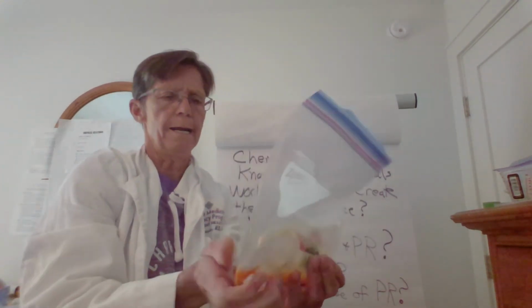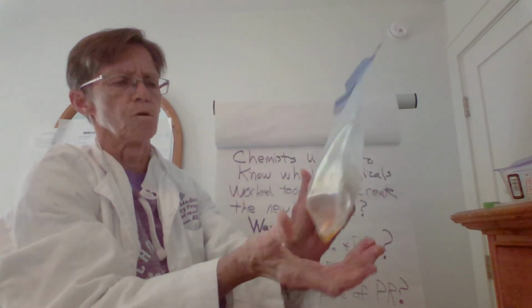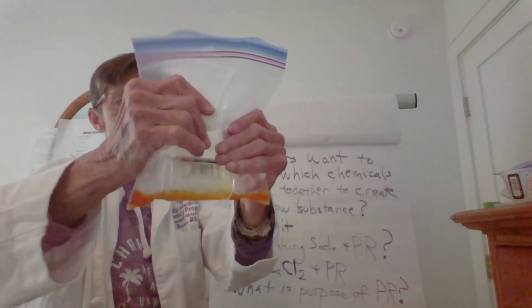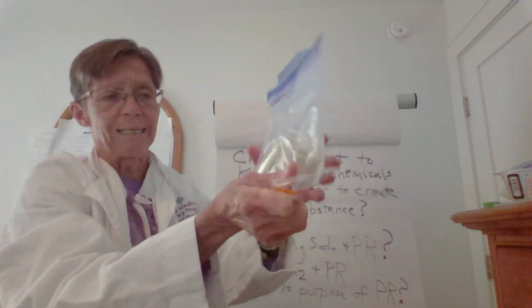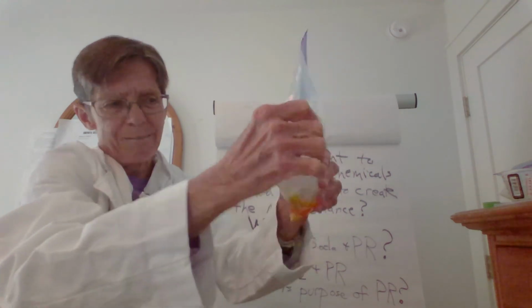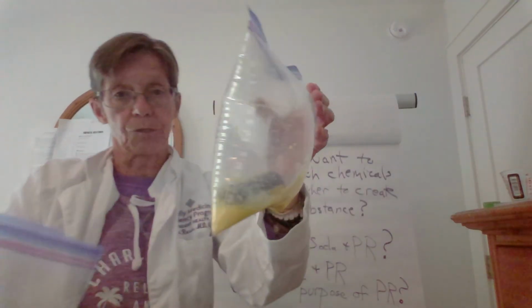Oh my. Oh, it's a little warm. A little warm, a little warm. Oh, but guess what? It did not do a whole lot to make anything gassy, okay? Maybe a little bit, but nothing compared to this one. Look how fat that one still is, okay?